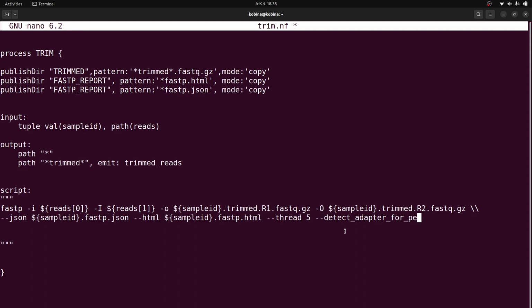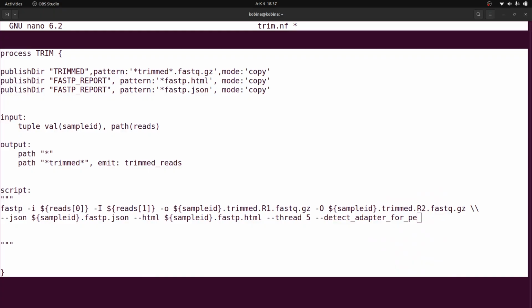So this becomes our final command. All right, so we can proceed. Okay, so everything looks good. For those who are also watching, you can take a screenshot and then try to retype everything and put it in your scripts. All right, so this is the code we are going to use for the trimming process. This is for trimming alone. So just take note of that.